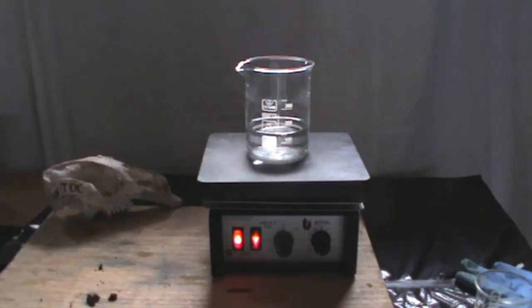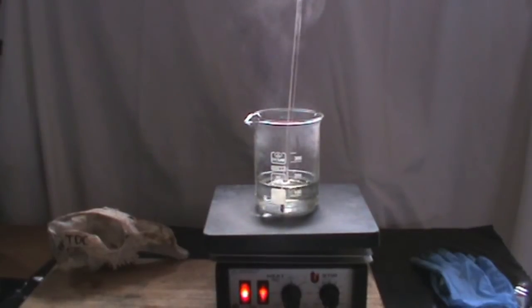To concentrate the aqueous sulfuric acid solution, we need to boil off the water until we see dense fumes of white smoke. Place the aqueous solution of sulfuric acid on a hot plate and heat. We can see the water evaporating off.